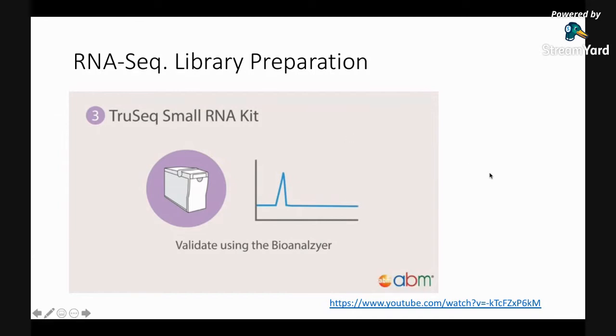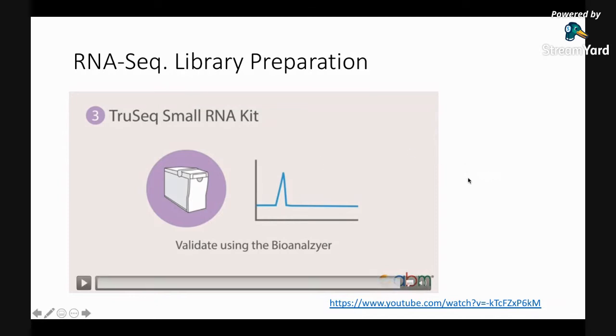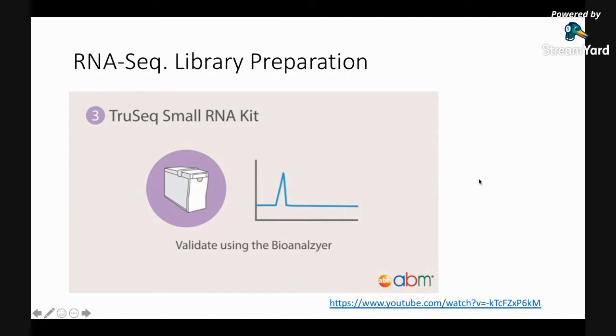Yeah. So that is how you choose. I hope the audio was working, that you could hear the audio from here. Yeah. So you can see that you have put the adapters, and you have chosen a specific fragment for sequencing. Yeah. So there are two things that have been done: adapter addition and the choice of specific fragments.